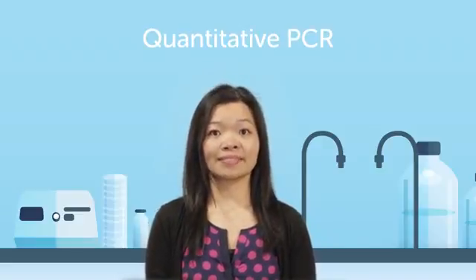Hi, I'm Maggie. Have you ever wanted to detect a low copy number DNA template in your sample or needed to accurately quantitate a gene's expression level? If so, you may consider using quantitative PCR.